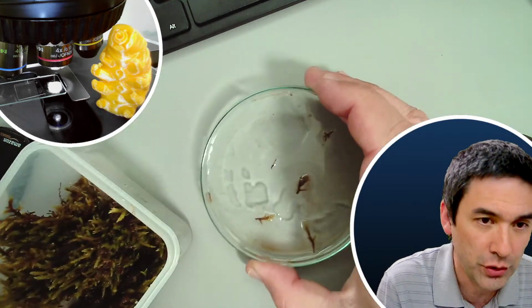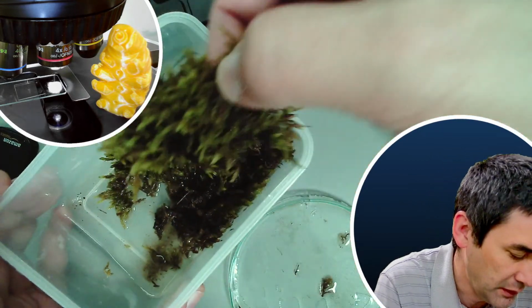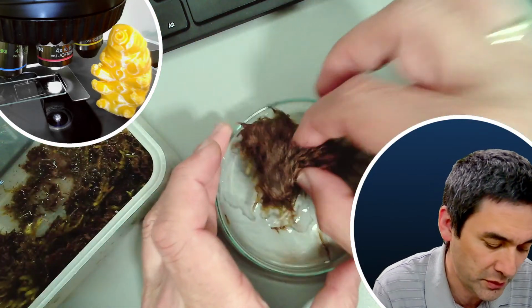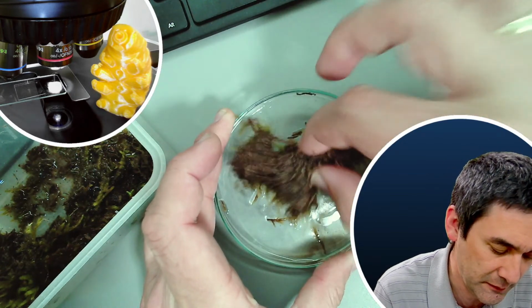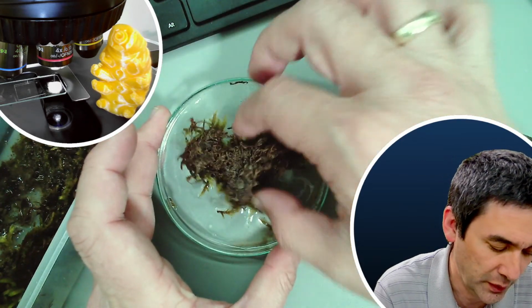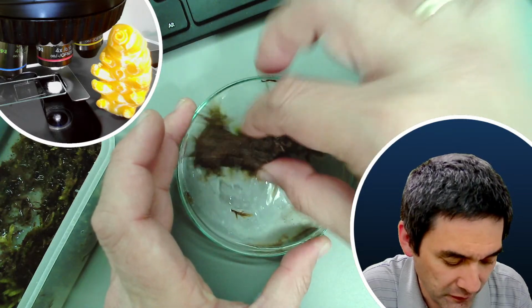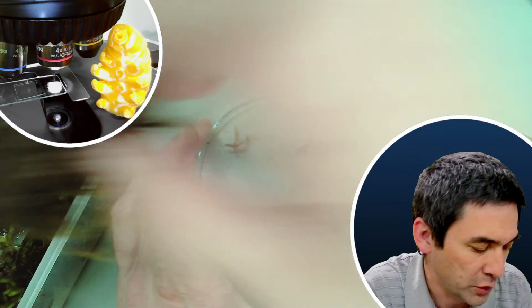You take a petri dish, or you can also take a plate if you want to, and you take a moss sample like this. It's all moist, and you don't take the soil so much, but you can dip it like this with a lot of water, and then you're going to see water collecting here on the bottom, with a little bit of sand as well, and some sediment. I don't want to have too much of that.